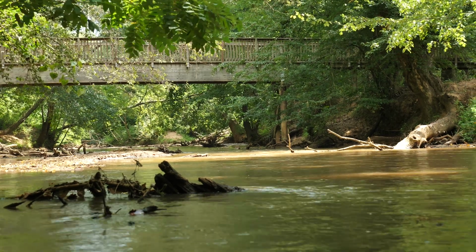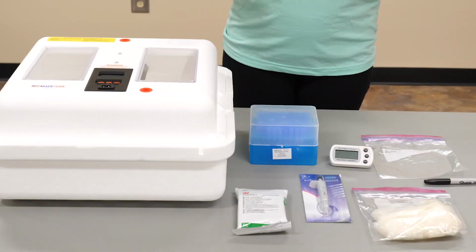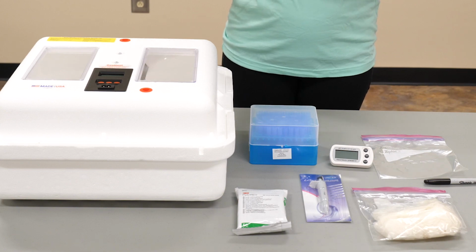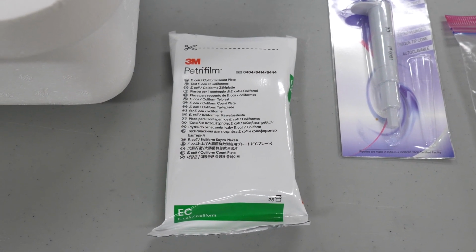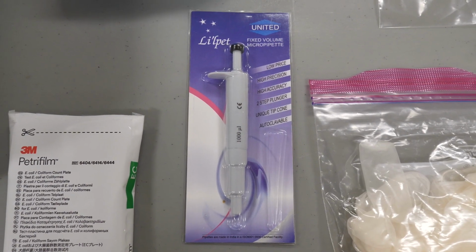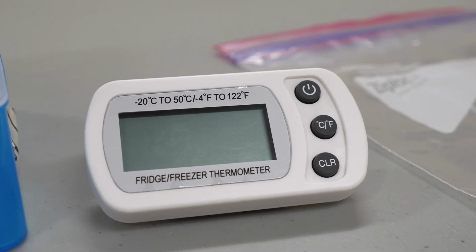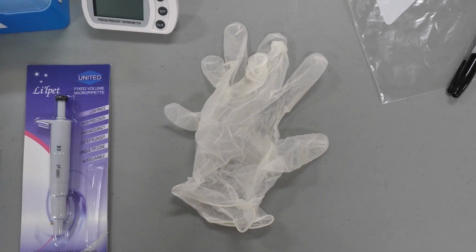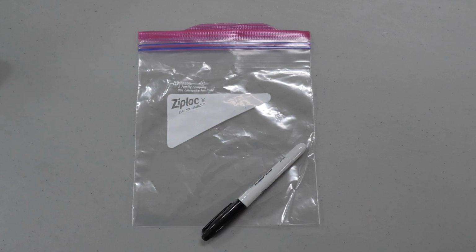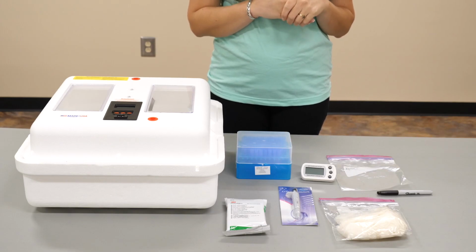Let's practice collecting and processing a sample to test for E. coli. First, you'll need to prepare your equipment. Before going into the field, make sure you have an incubator, 3M Petrifilm plates, kept frozen prior to use, a fixed volume pipette, sterile pipette tips, 1 per water sample, a digital max min thermometer, a permanent marker, gloves, disinfectant spray, and a Ziploc bag. These items will stay behind wherever you plan to complete the bacteria incubation.